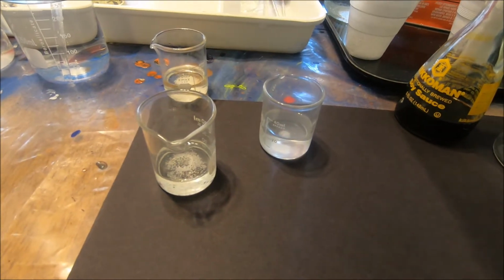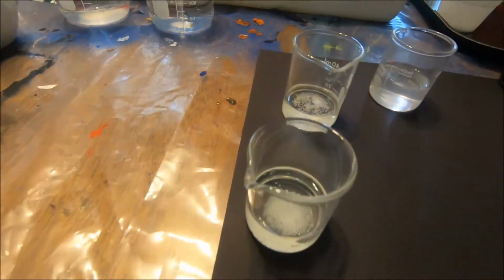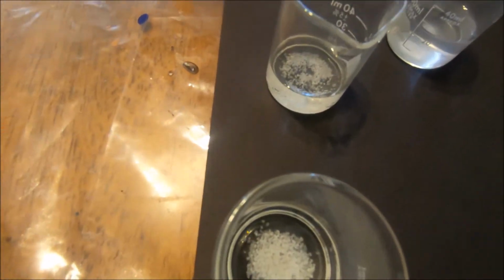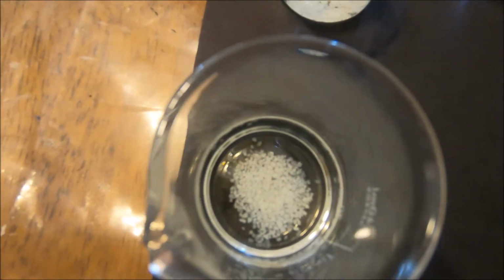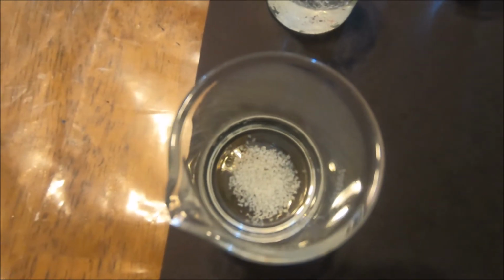I set this up earlier. This is actually salt from yesterday with oil. Even after sitting there for an entire day, you can see that nice cubic structure of the salt. It still hasn't dissolved in the oil, versus in the water, where it's basically almost all dissolved already.